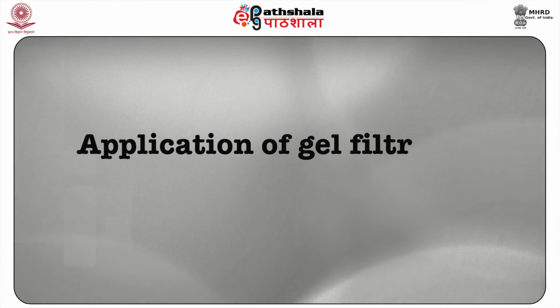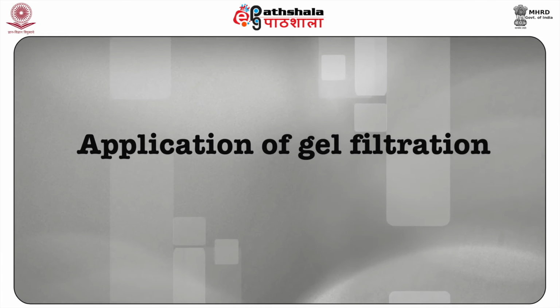Now finally we will discuss the application of gel filtration chromatography. Gel filtration has been used for several purposes, which are briefly described here in this module. The first application, students, is desalting or group separation. In a number of investigations, as during preparation of nucleic acids and protein purification, inorganic salts or other low molecular weight reagents are extensively used, which often have to be removed from the final preparative compound. This can effectively be achieved by passing the preparation through a column of Sephadex G10 or G25.